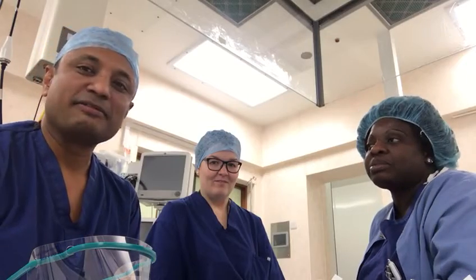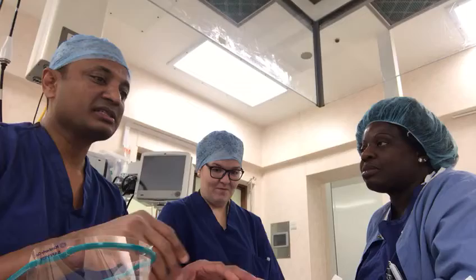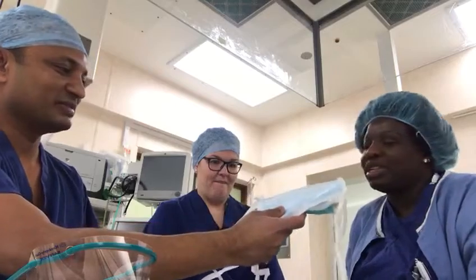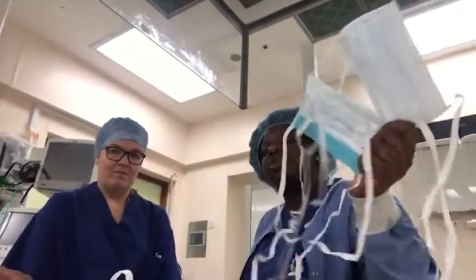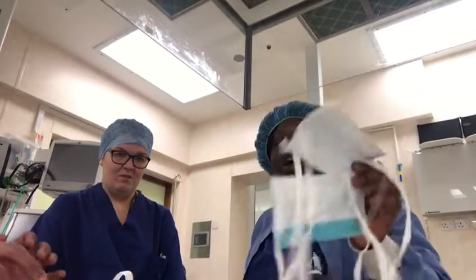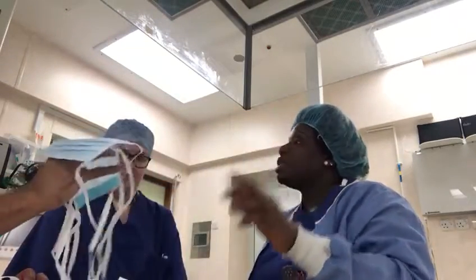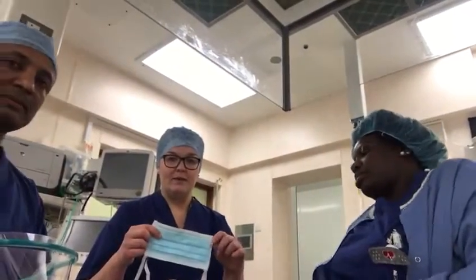Nicola is a trainer and fit tester for qualified masks. I've got a few masks here. She's going to explain what they are. These masks are just normal surgical masks which surgeons use in theatre. They don't protect against TB or coronavirus — they just protect from splashes of blood.